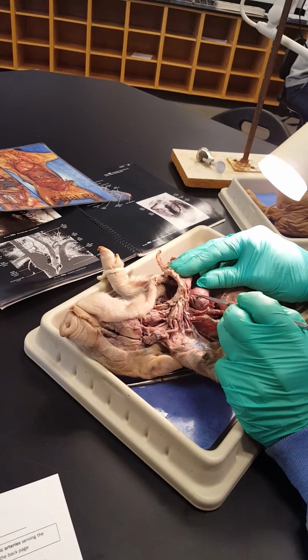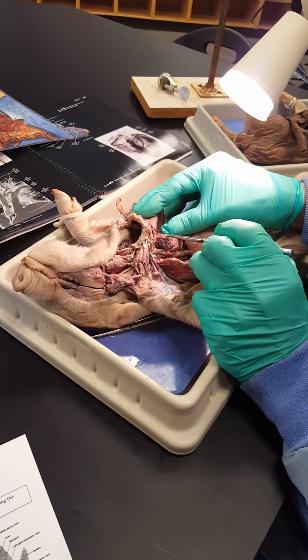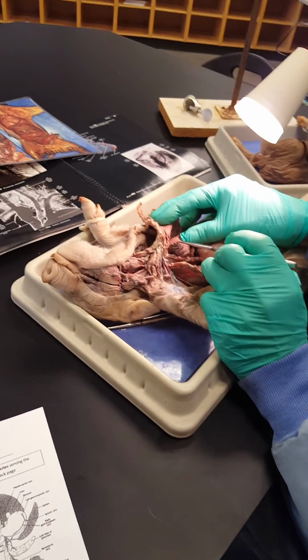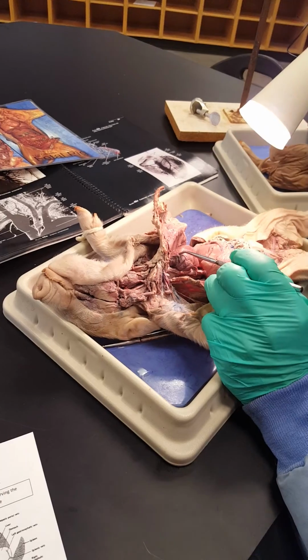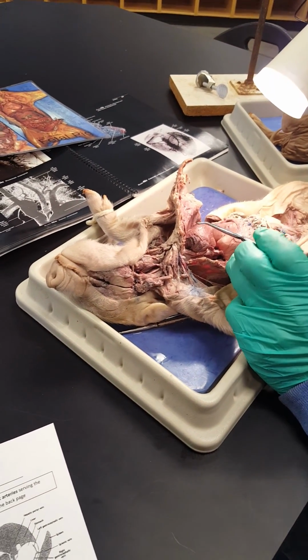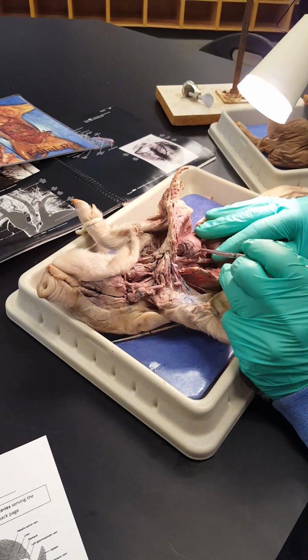And around the fringe of the right atrium is this little frilly thing called the right auricle. The right what? Auricle. And it's the same term as we use for our ear flap. It looks kind of like a little ear. But it has a connection with the atria, so it's part of the chamber.